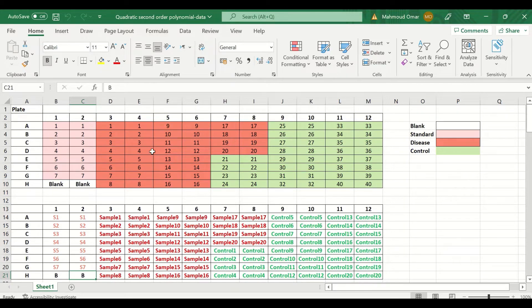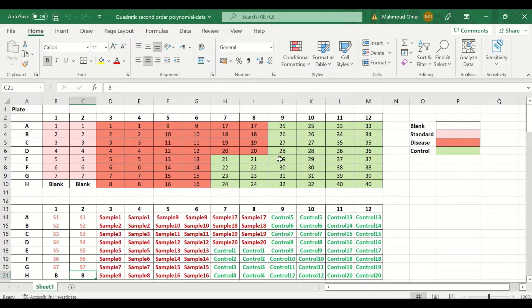Each sample loaded was color coded: light pinkish for the standard samples, light red for the diseased unknown samples, and light green for the unknown control for comparison. Each sample was loaded in duplicate and the absorbance was measured at 450 nanometers.